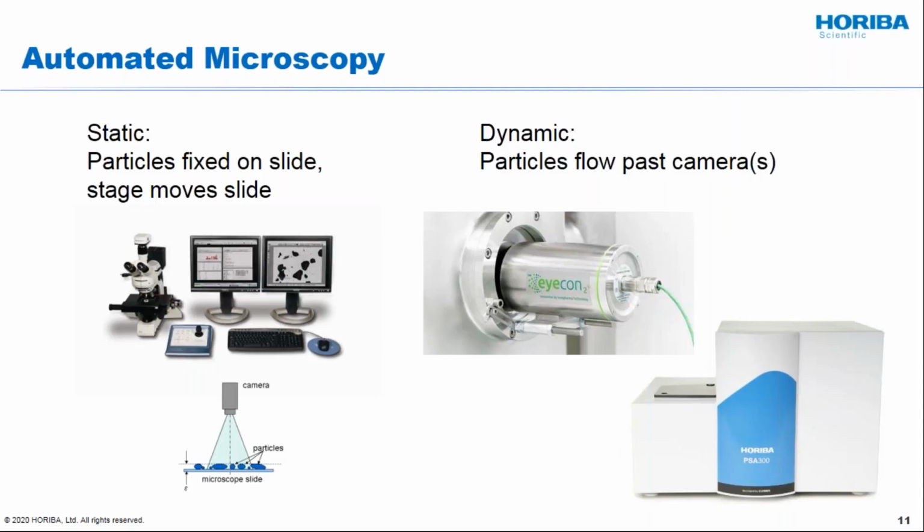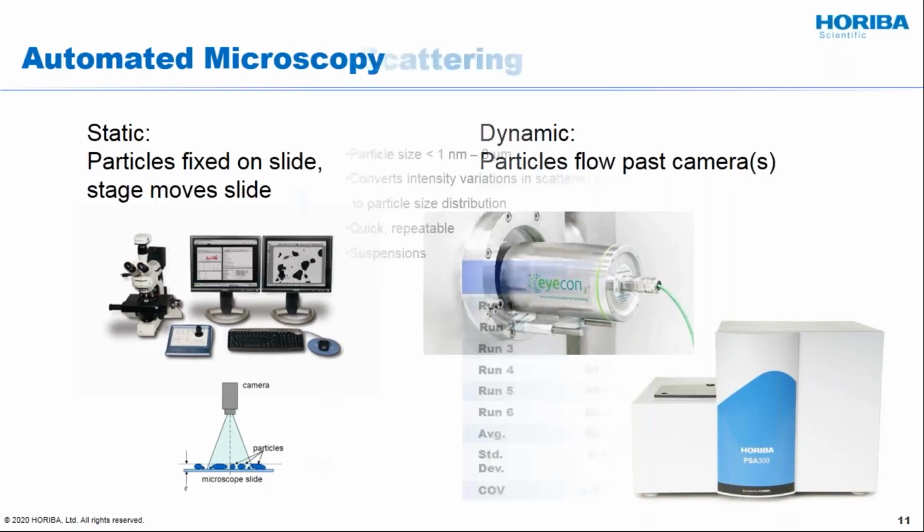And the big thing is, once you get it into the container, it's kind of a little late to decide you want to size those particles. So a lot of people would like to capture this information right during the process so they get a relatively accurate representation of their particles. And again, we have a little section here a little bit later on. We'll talk about some of these different ways of doing the sampling that is going to become so critical.